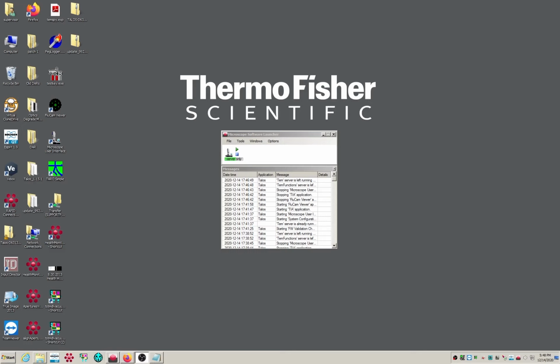In this video, I'm going to show you some of the basics, like how to run the software and how to adjust the eccentric height. And I will talk about how to focus.